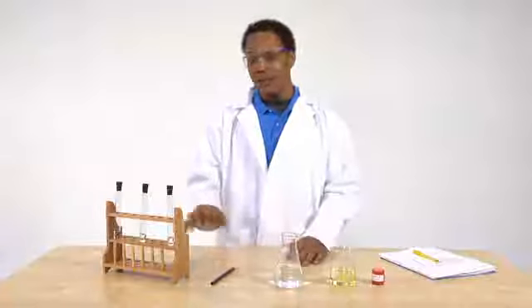Before we get started, remember, never touch or taste any chemicals. Handle glassware carefully. And always wear your lab coat and safety goggles. Here's the equipment and materials we'll need for this lab.